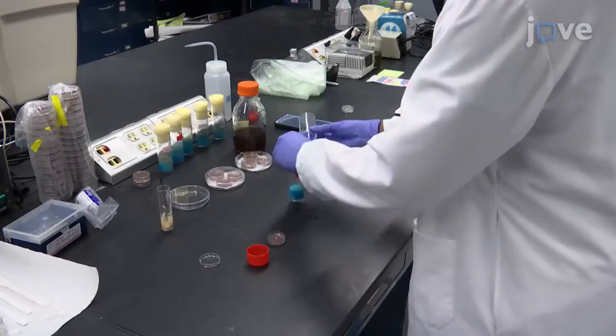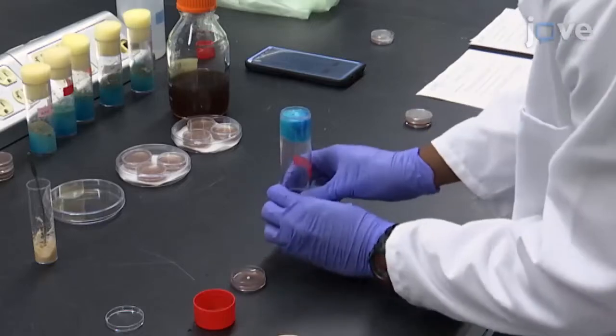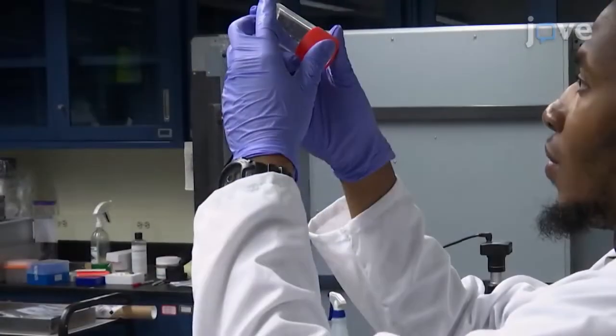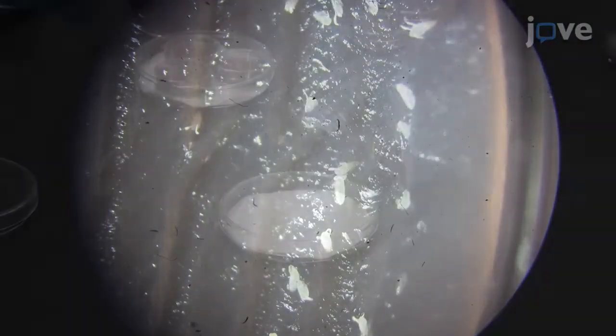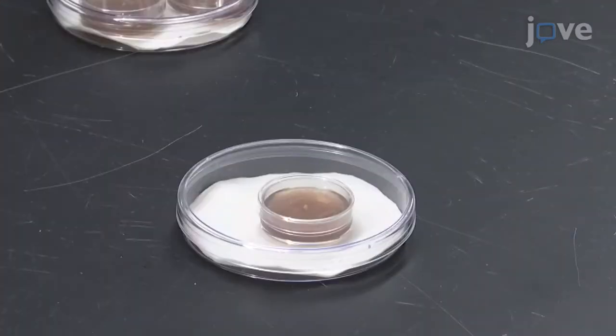For embryo collection, first place two virgin Drosophila females and one young male inside the collection cage for 24 hours. The next day, inspect the bottom of the agar plate to look for embryos. If embryos have been laid, transfer the agar plate into a humid chamber and cover the plate with the lid to avoid dehydration.